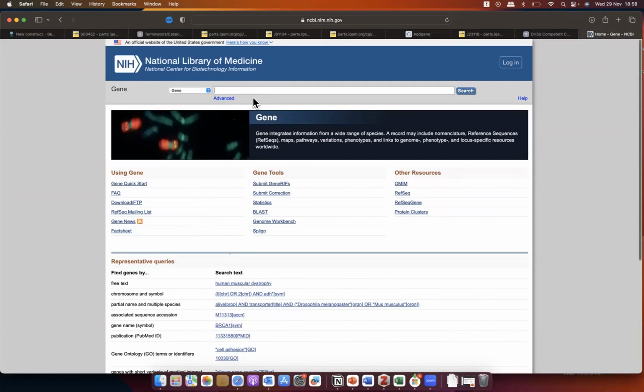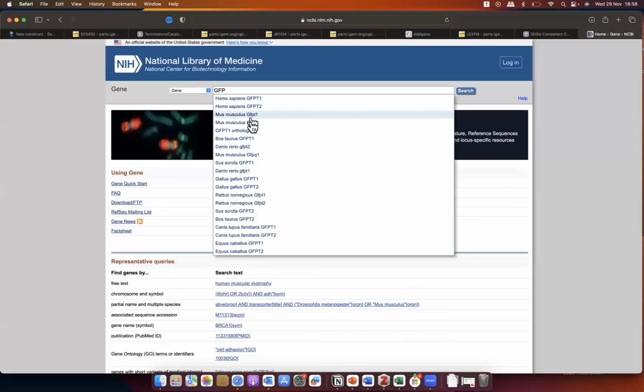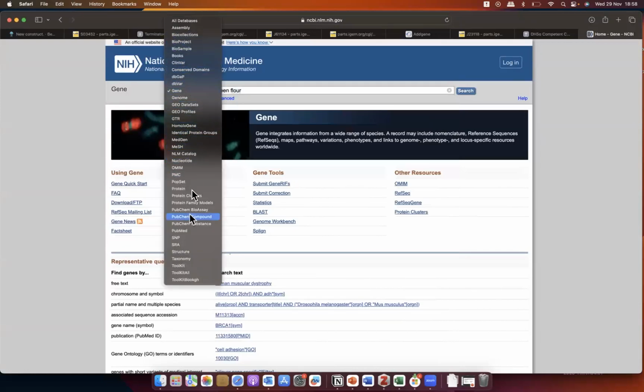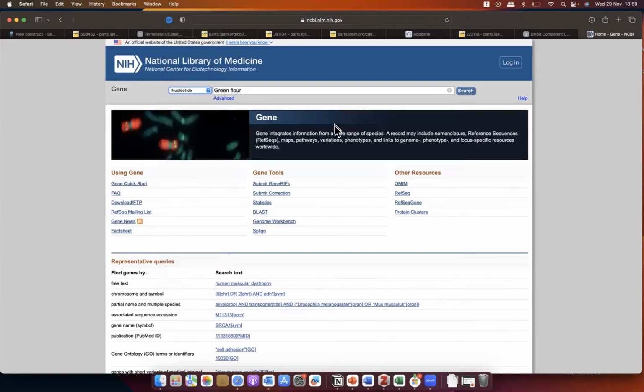What you can do is look for GFP and then select, for instance, Homo sapiens, Mus musculus, and these are all transcription factors actually, because it's not recognizing it. There are different types of repository, as you can see. Some of them are used for assembly, collection projects. Some of them are a collection of sequencing data or other types of data. It's a very complex type of repository and very long to explain, and that's why we're not really talking about it too much today.